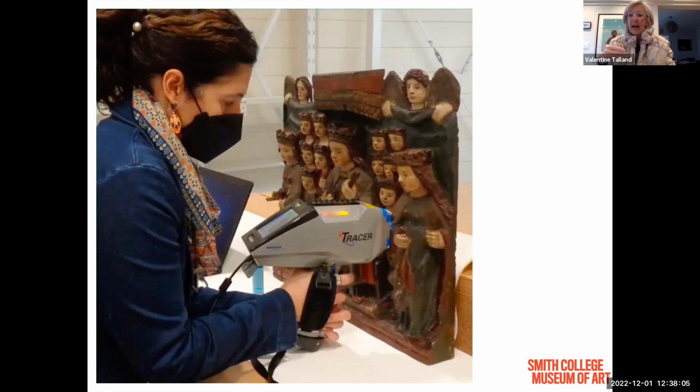And it is shooting it out, or what we call fluorescing it out, onto the sculpture, where there are pigments in the paint which are going to react to that highly filtered energy. And in turn, those pigments are going to fluoresce themselves. So the other thing the tracer is doing is sending out the X-ray, and then sensing the secondary fluorescence from the pigments. It is what we call a qualitative, not quantitative, technique. It tells us about the presence of certain things. It does not tell us how much.